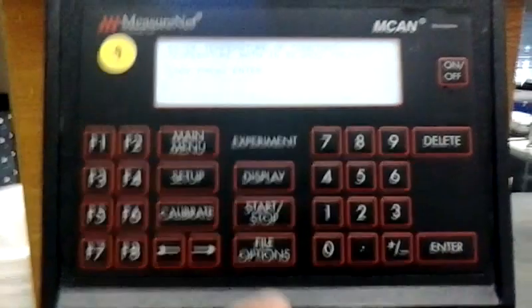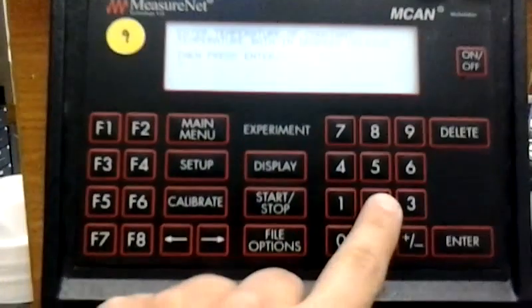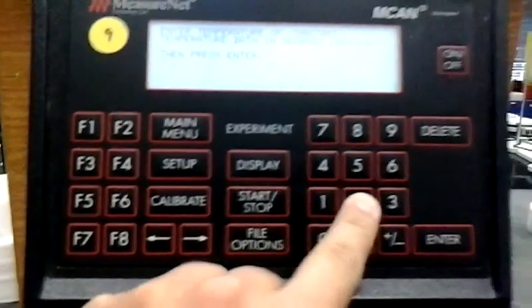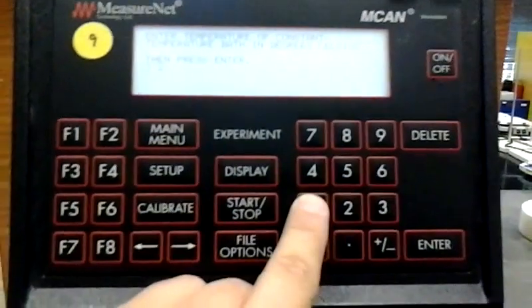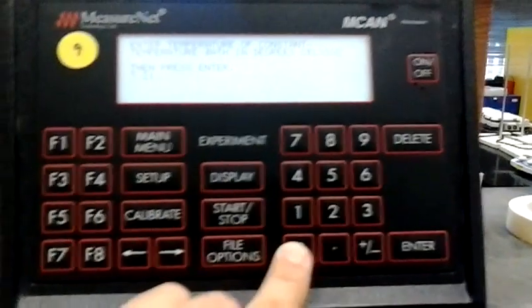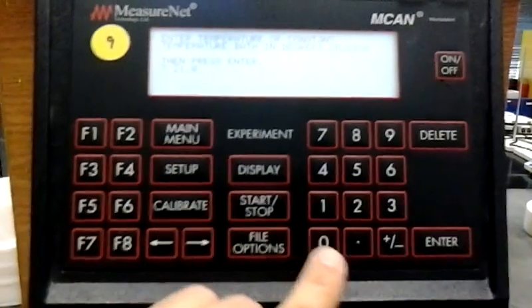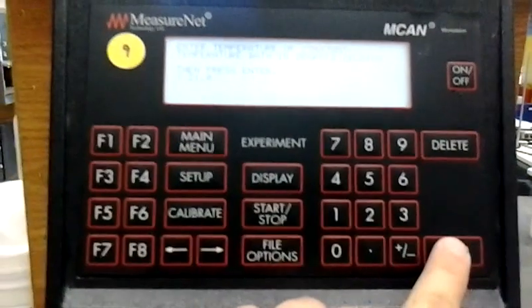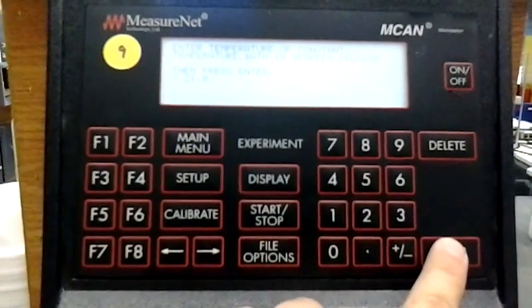About 21 degrees Celsius. So you come back up to your MeasureNet and you type in 21.0 and hit enter.